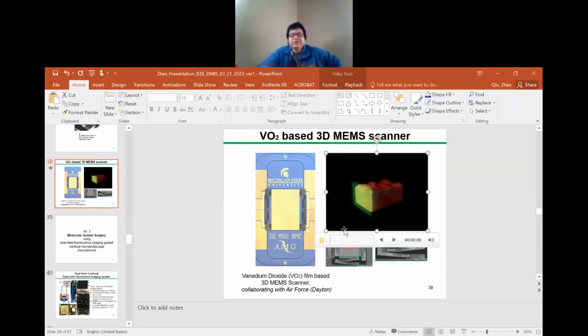So this is vertical, and then you move along the lateral, and then again, for example, using a mirror, you can stitch or you can do the stacking and get the 3D. That's how we integrate those data to get a 3D, no matter horizontal or vertical.